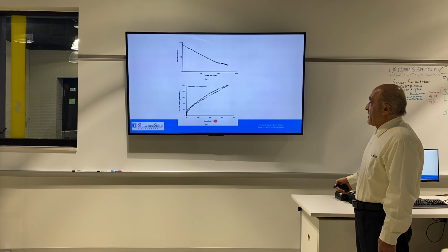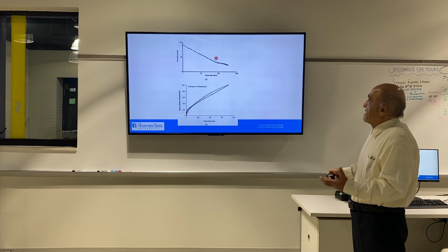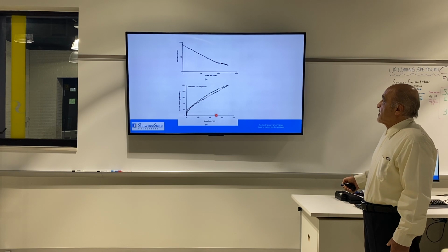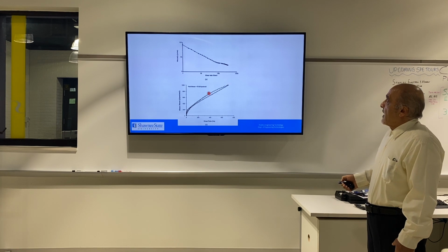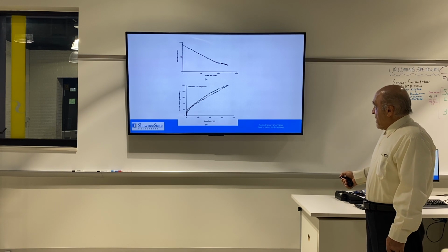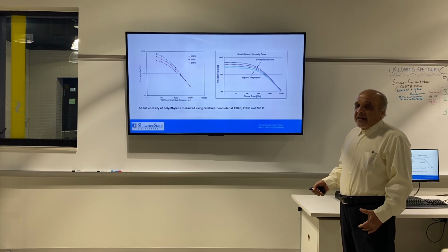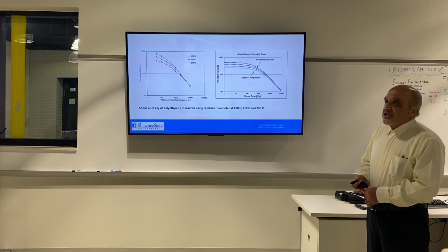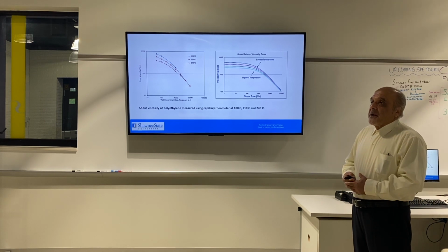But when you increase shear rate, your shear stress is increasing. So this is a relation between viscosity and shear rate, and shear stress and shear rate. This is a general, typical graph for any type of polymer melt rheology. So the main concept and key point for that experiment is the relation between viscosity and shear rate, and shear stress and shear rate.